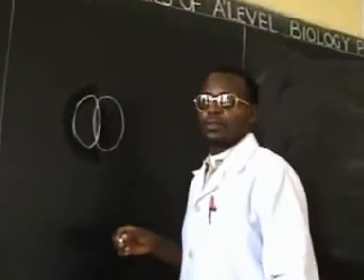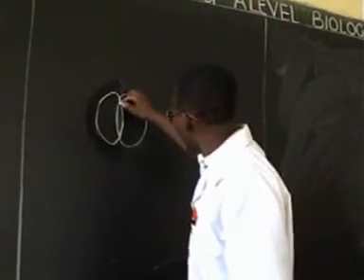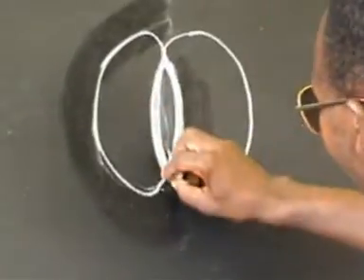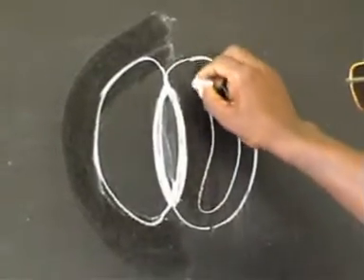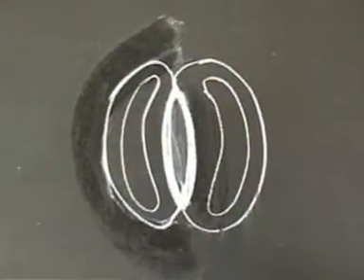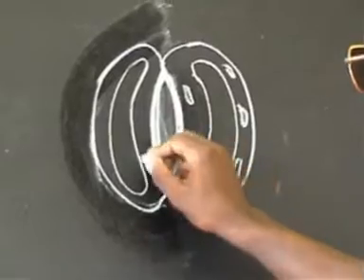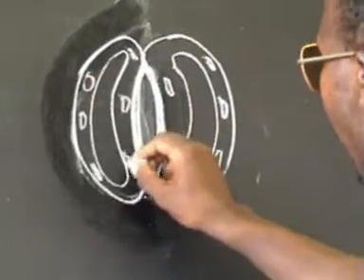Okay, I will start by drawing my guard cells. This is how the guard cells were, and I observed that this inner wall here is thicker than the outer wall. And I also saw the vacuole, which is elongated like that. There were many colored things like this inside, but the nucleus was very distinct.